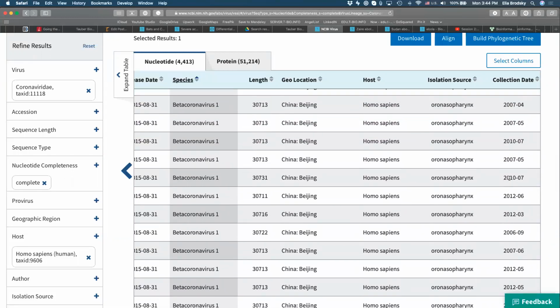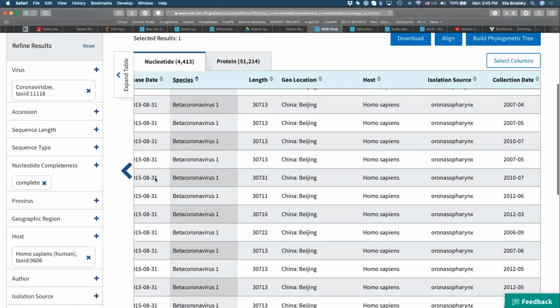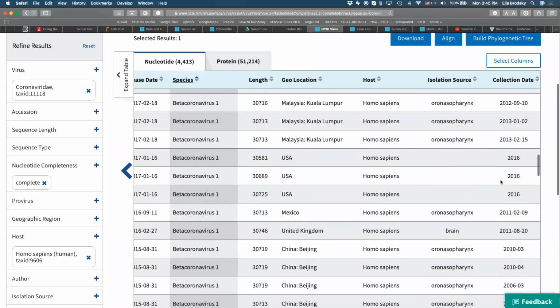Okay, so first of all, yes, you're right. That's a good question. Which one is more abundant? But given other types of sequences that we will be looking for from other strains, right? When you think about trying to minimize variance just because of date, for example, we're going to select also the SARS, the novel coronavirus, right? For the novel coronavirus, which dates would that include? Since it was detected in 2019, you're likely going to only find 2019 to 2020. So when we want to find additional comparisons for that, we probably want to take some of the latest ones, right? So maybe instead of taking the older ones, and maybe those are more abundant, we would want to find whatever the latest one might be.